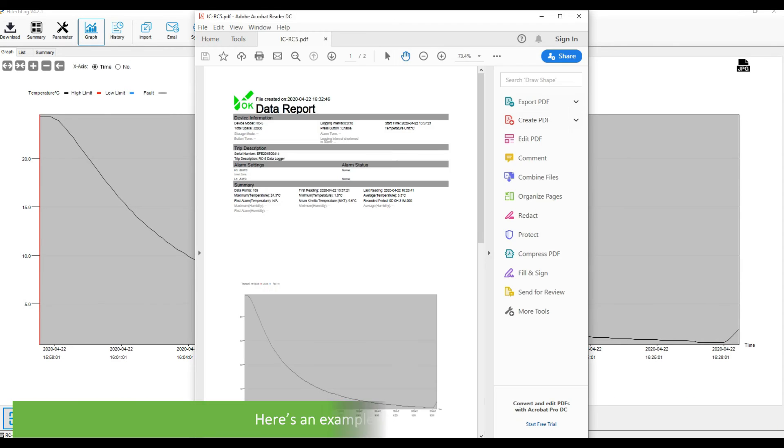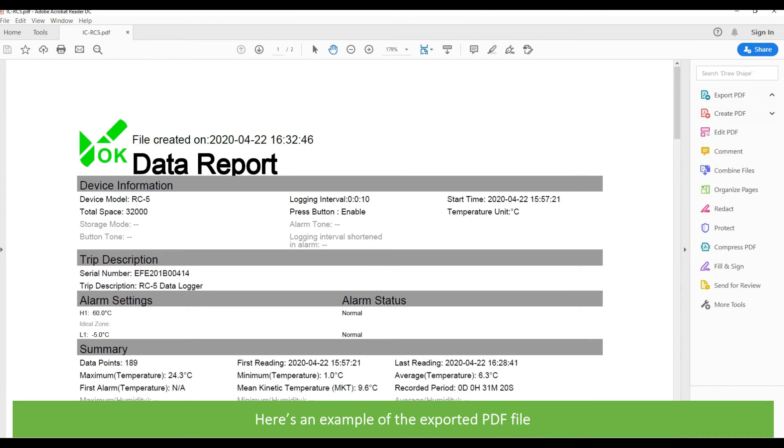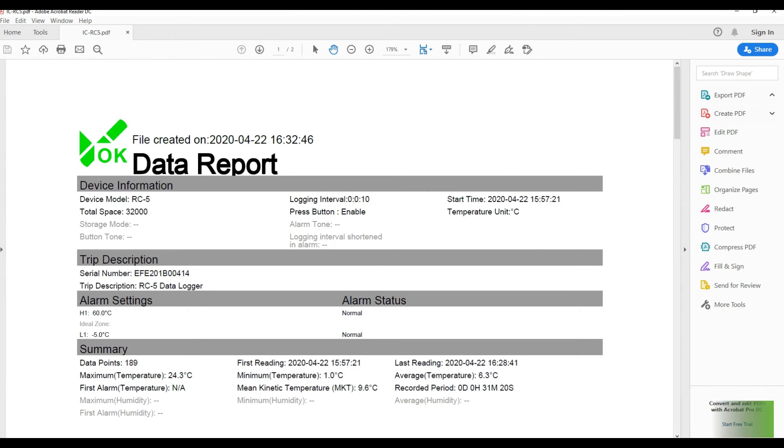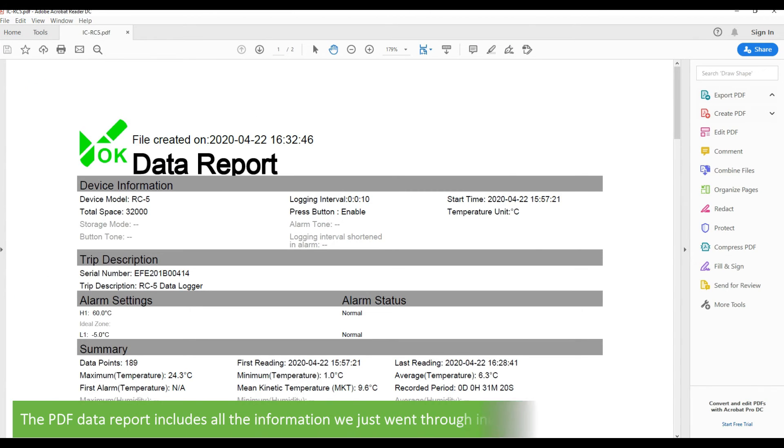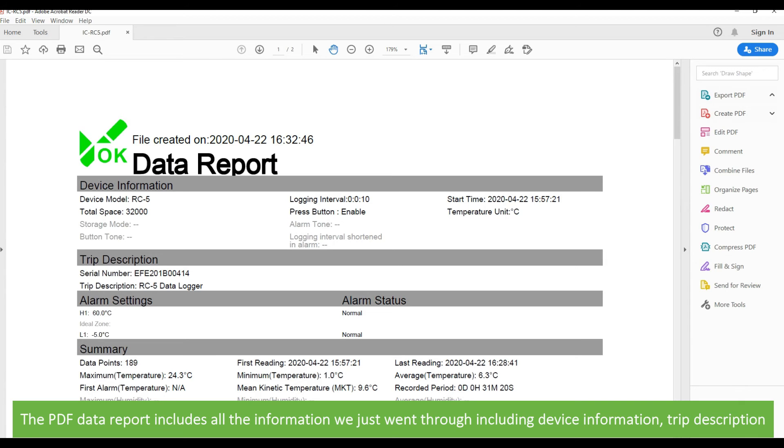Here's an example of an exported PDF file. The PDF data report includes all information we just went through, including device information, trip description, alarm settings, and summary.